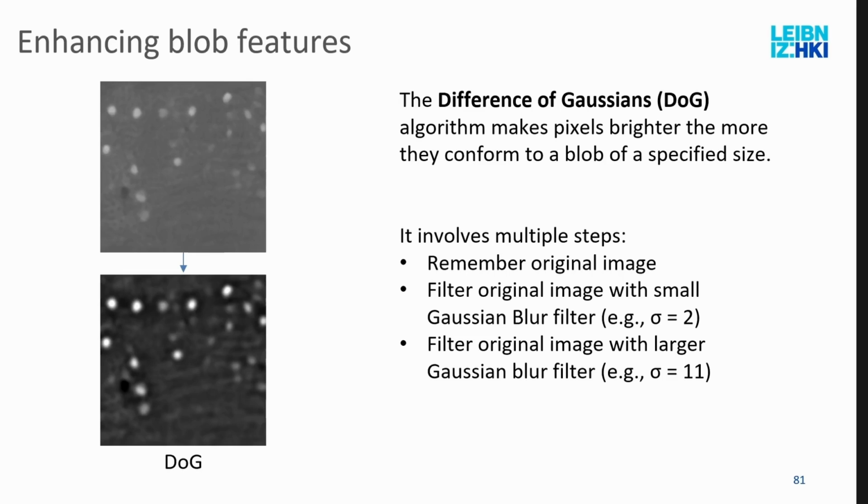So it takes the image, applies two Gaussian filters with different sizes on it, and then subtracts the images that come out of it. And this way, it really highlights this one that is quite bright, but here we make it really, really bright. For the ones that are not so super highlighted, like this one here, it gets definitely brighter.